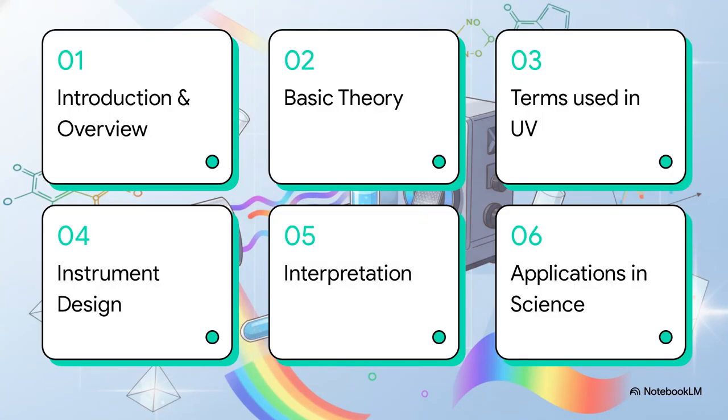So here's our game plan for today. We'll hit 1. Introduction and overview, 2. Basic theory, 3. Terms used in UV, 4. Instrument design, 5. UV vis spectra interpretation, and finally, 6. Applications in science. Let's jump right in.